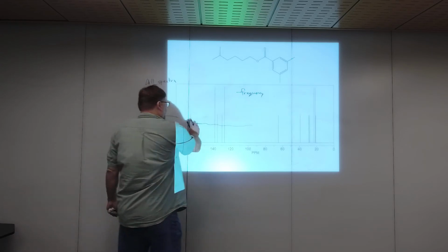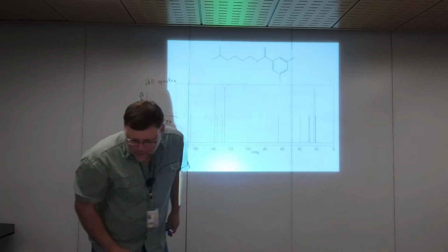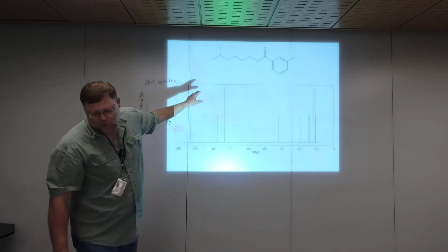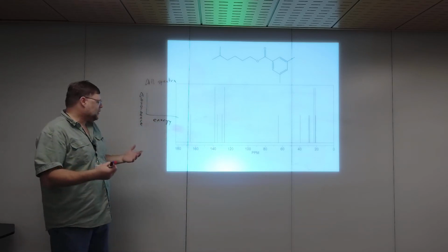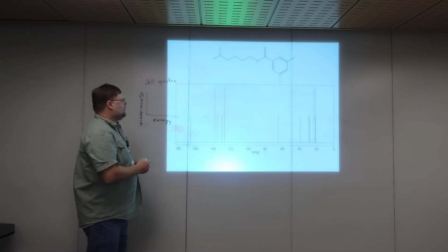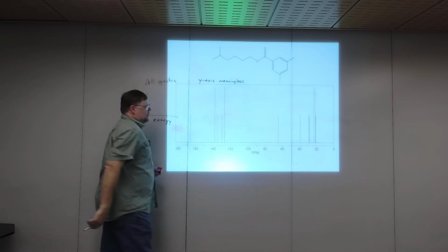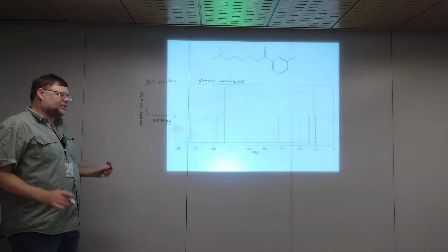All right, so again, I just jump right in. I'm checking to make sure none of these lines fall in the cracks, and they don't. So up at the top, you see a molecule. Here's our molecule, and here's the C13 NMR. So here's what a C13 NMR looks like. Basically, the y-axis doesn't tell us anything. In a C13, the y-axis is essentially meaningless. This is a synthesized spectrum, so it's not quite meaningless.